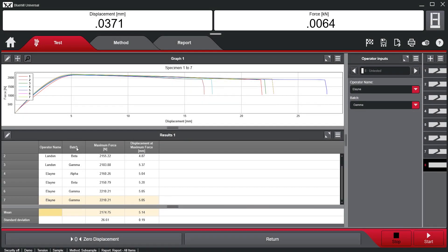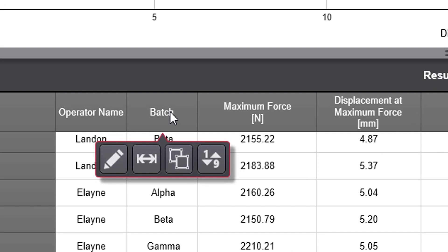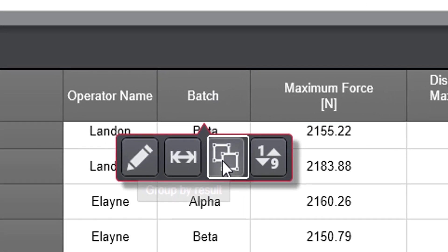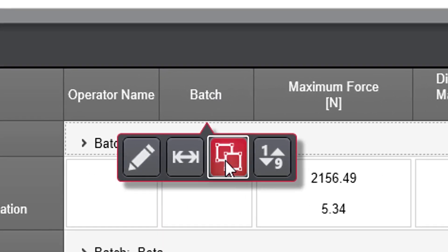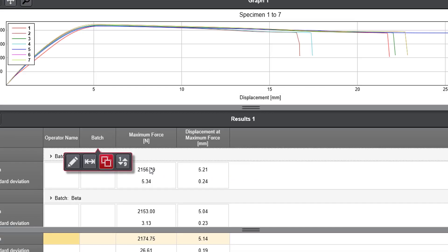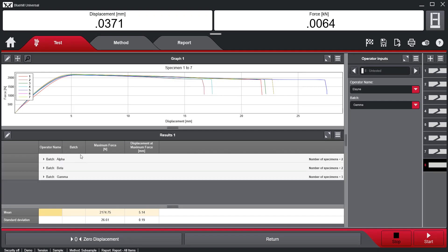With the subsample functionality, the user can choose any result criteria as a grouping criterion. If you wanted to compare the test results based on batch number, for example, you would select the result column heading and then press the Group by Result button.